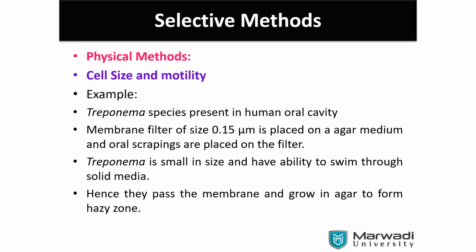Because to study, to observe, to learn about them, we can't see with the naked eye, so we need to use the microscope. So it will be converted into the microorganism. So is the plant a microorganism now or not? Mucor, we can see mucor. It's a fungus visible with the naked eye. You can observe it's mucor.